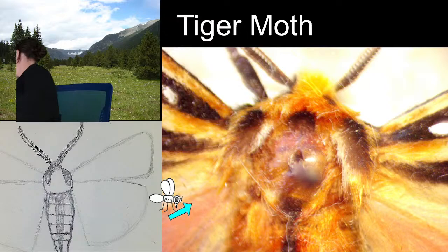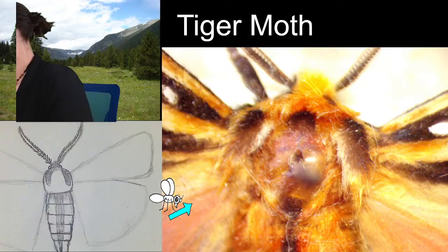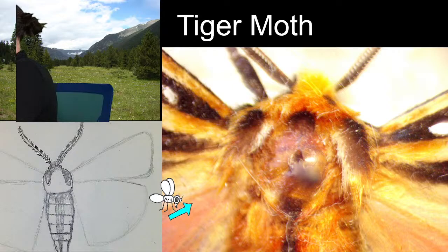Here. This specimen does not have great wings, but it does have a good thorax. And you know what? I believe these are the same species. They were collected on the same night.